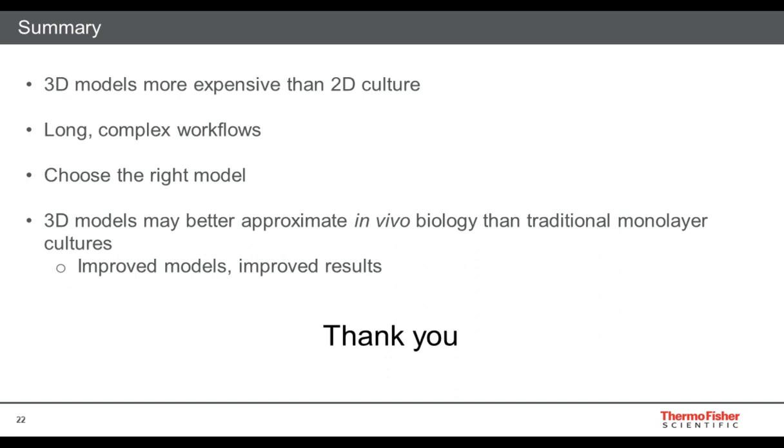So let's get started. The first question is, what are some of the differences between pluripotent stem cell models and adult tissue-derived models? This is a good question.